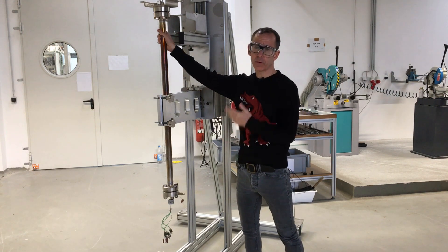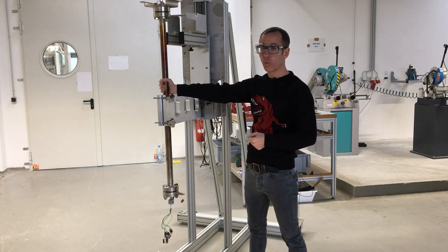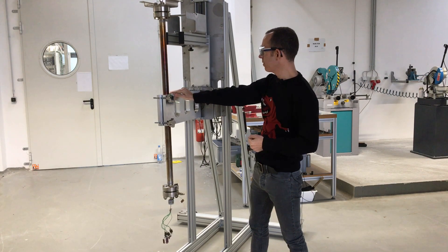Inserting and removing a reactor of this size from a split shell oven is just ergonomically not possible, at least not with one person. To make people's lives easier and to make it possible for a single person to do this, we developed this tool here.